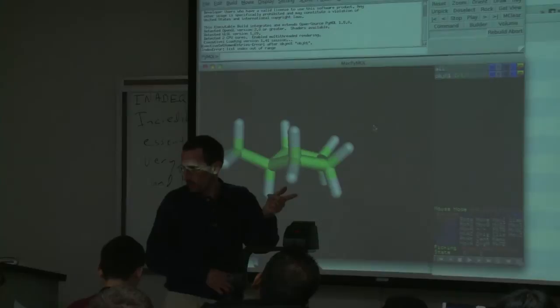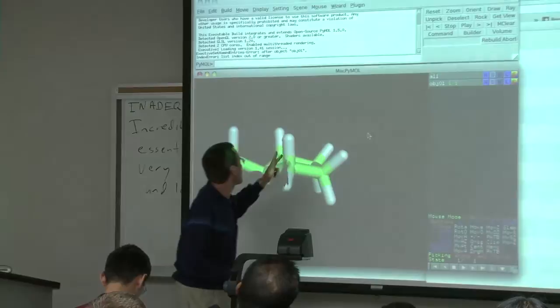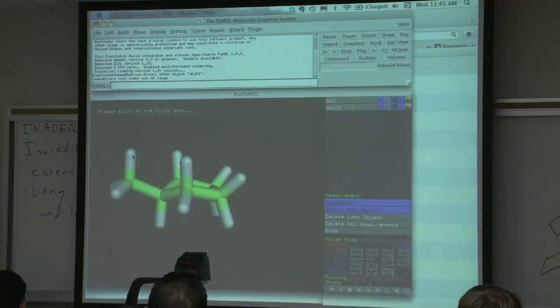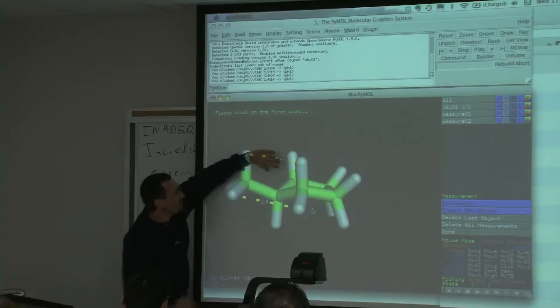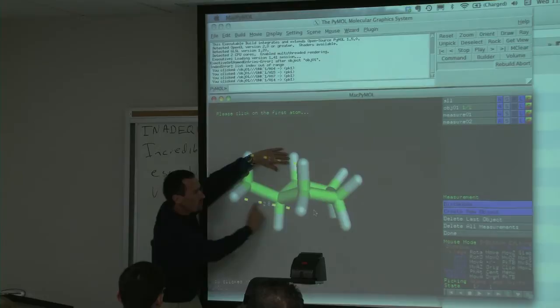It was that hydroxyproline one where we had to figure out the stereochemistry from the NOEs, and I think it was in part confusing because in the 1D NOE there was nonspecific irradiation of the diastereotopic methylenes. One of the points when I introduced NOEs earlier on, and we were talking about distances, was that on a cyclopentane ring, if you've got a cis relationship or a trans relationship, you're going to have some difference in distance, but it isn't necessarily so. If I only saw an NOE here and said, oh, these two must be cis to each other because 2.8 angstroms will give you a nice strong NOE, you'd be absolutely wrong here.